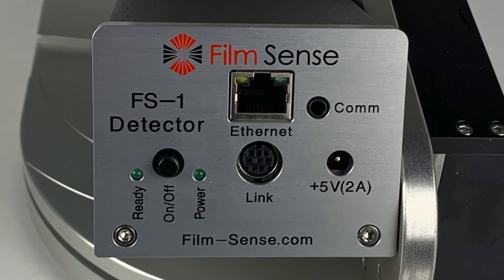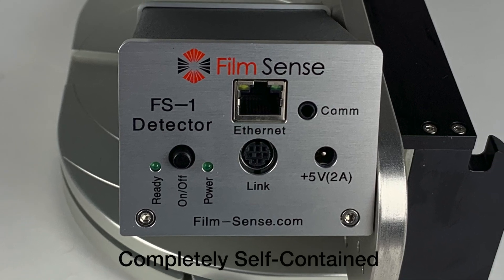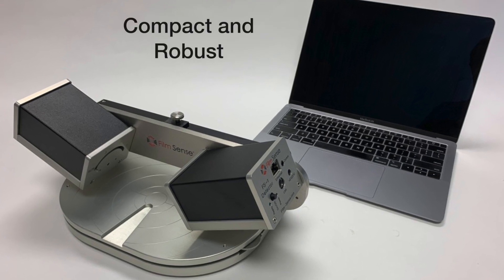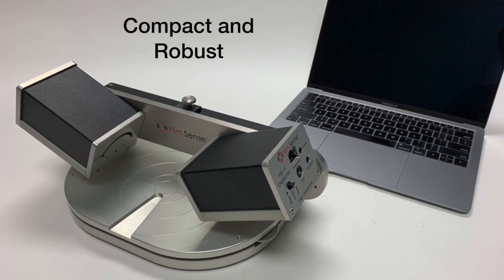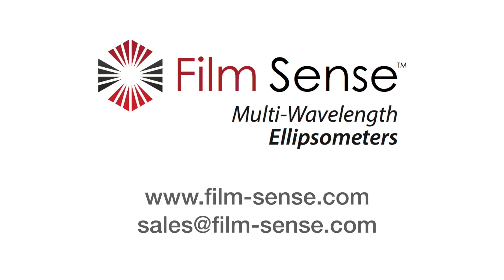The detector unit also contains the control electronics and computer that runs the software, making the FilmSense ellipsometer completely self-contained. The FilmSense hardware is compact and robust, making it ideal for both ex-situ and in-situ measurements.